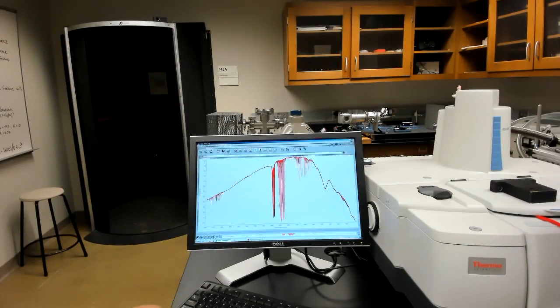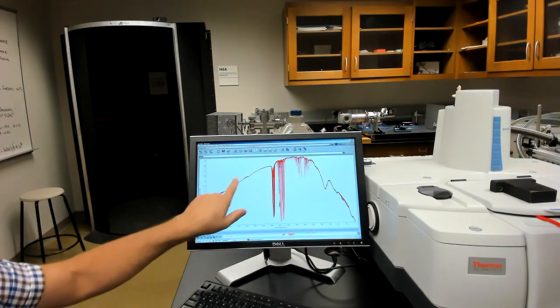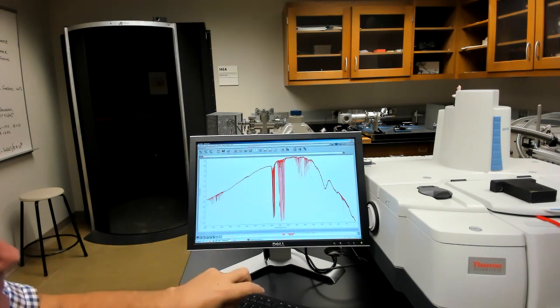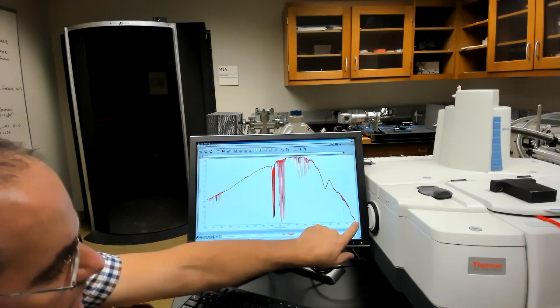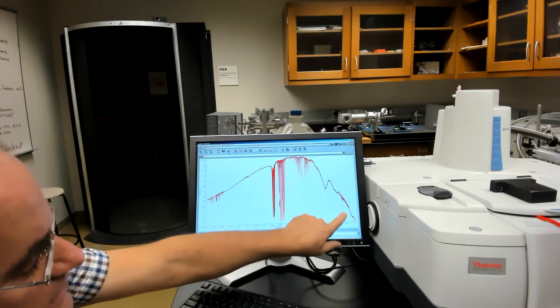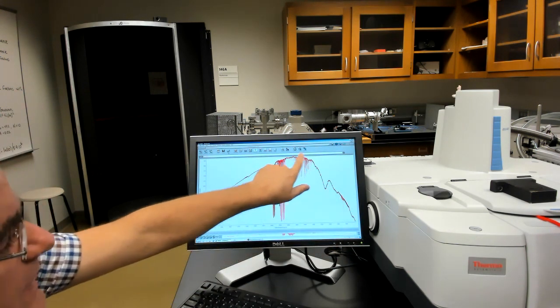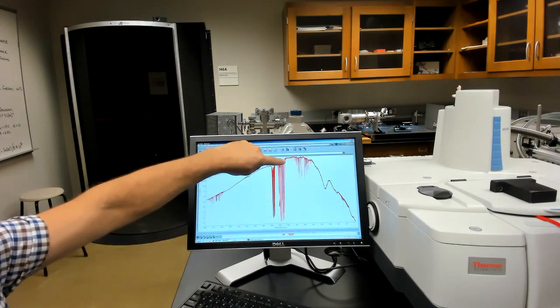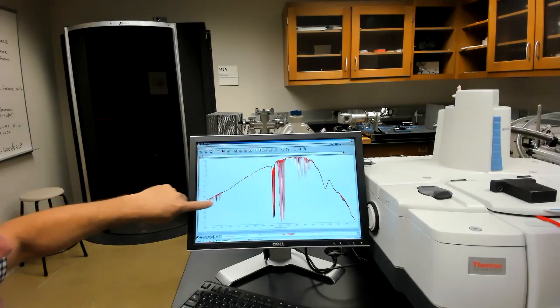Take a look at the data that you see now. You can see several series of bands across the spectrum. It looks somewhat similar to what we looked at in the low resolution preview, but this is much higher resolution. Starting from low frequencies, first we come to a rather sharp, narrow band here, then to some relatively weak lines that are broadly distributed, then a series of lines here, a second series of lines here, and then at higher frequencies, some more weak lines.